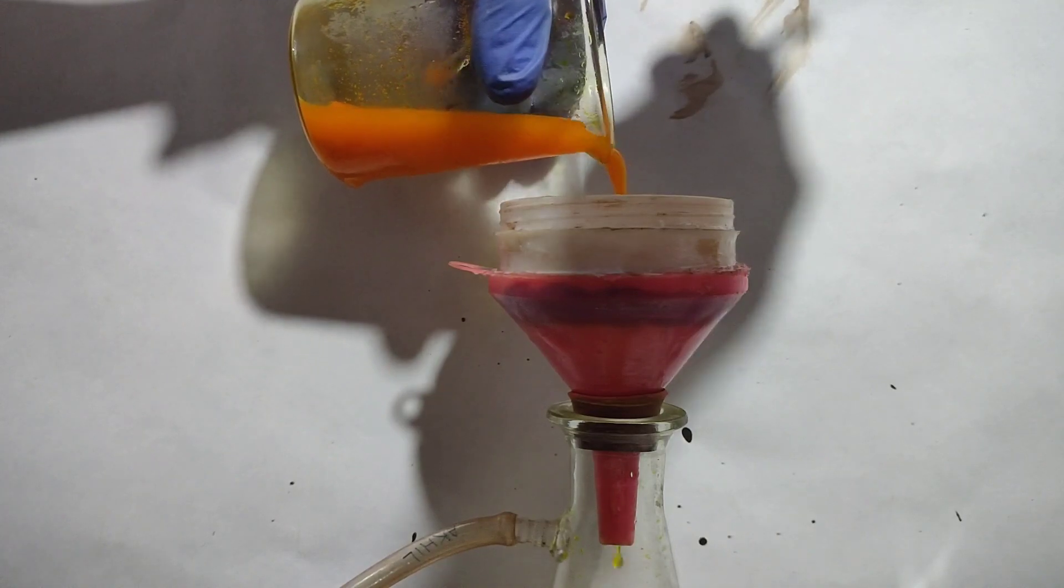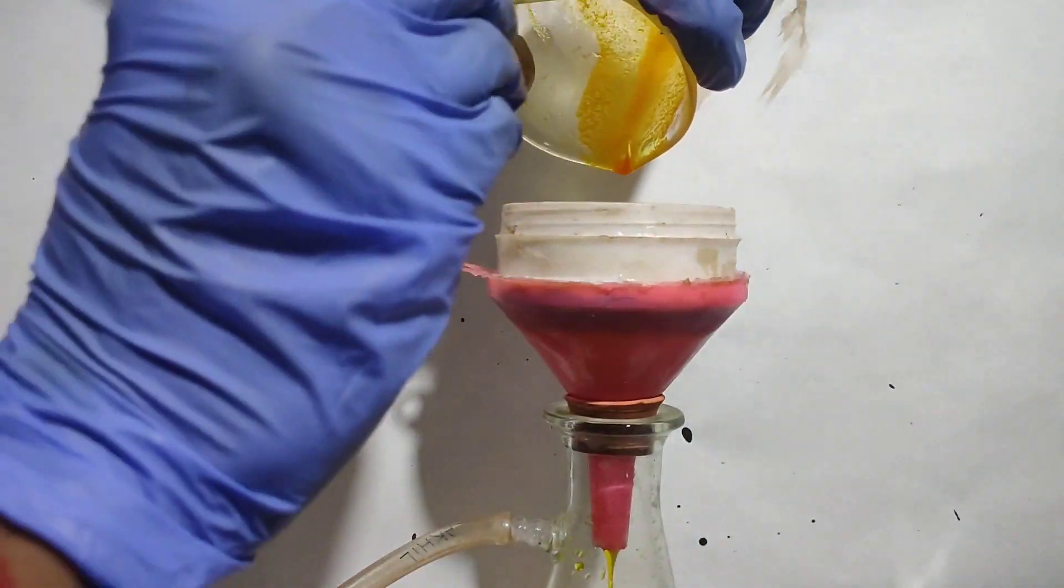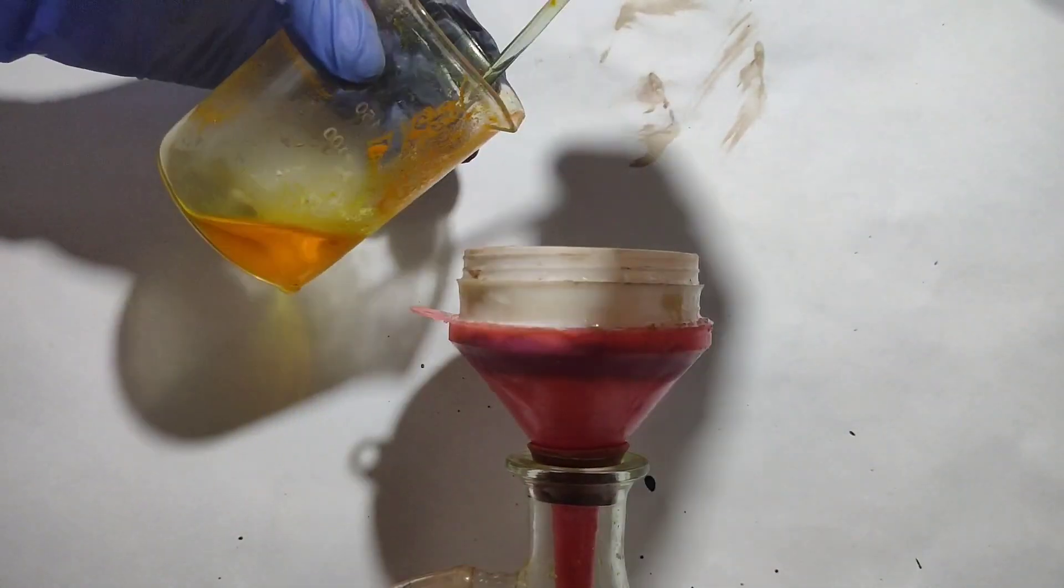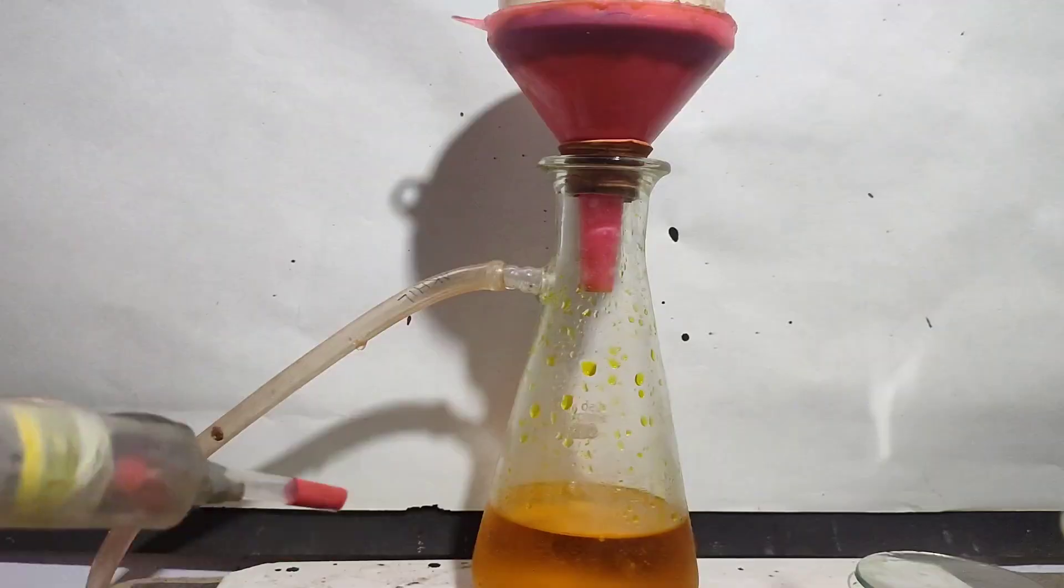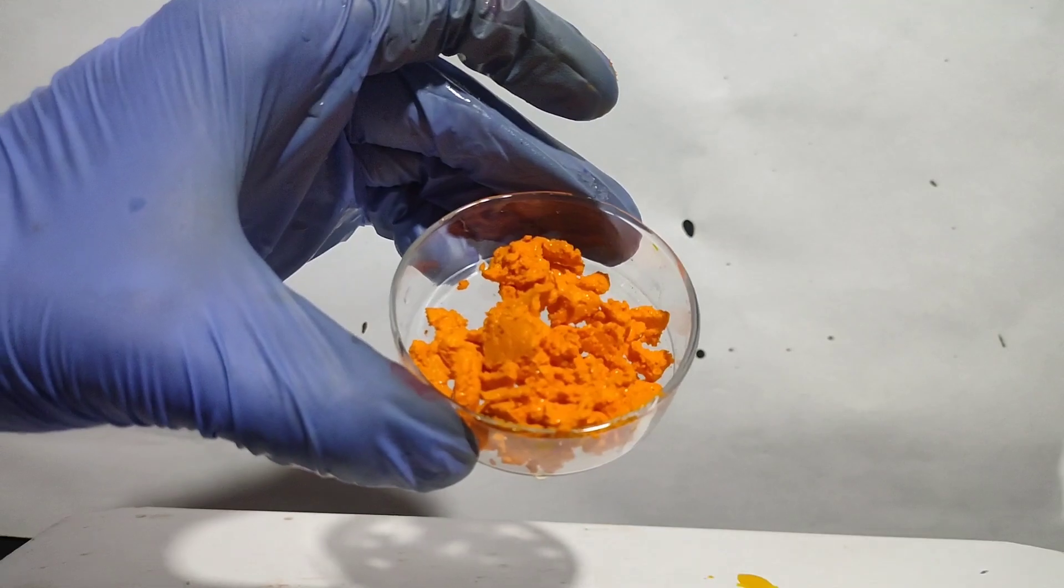I filtered these crystals on my Buchner funnel on vacuum filtration and washed the crystals with ice cold distilled water. Then I took out the crystals with a spatula in a pre-weight petri dish and dried these crystals in a desiccator for 2 days.